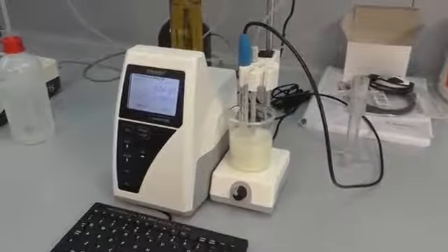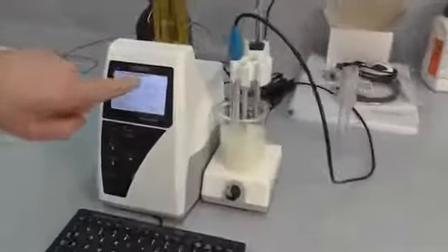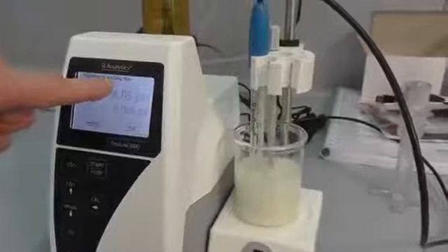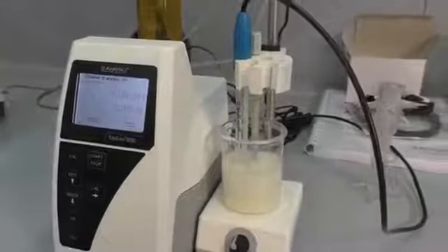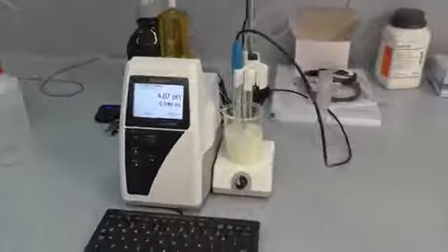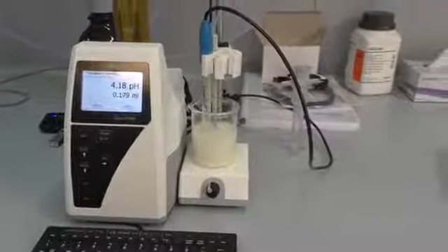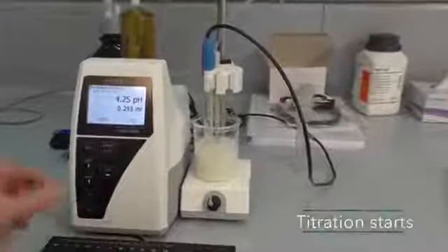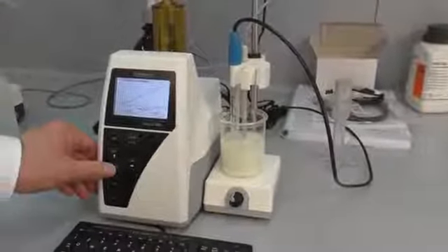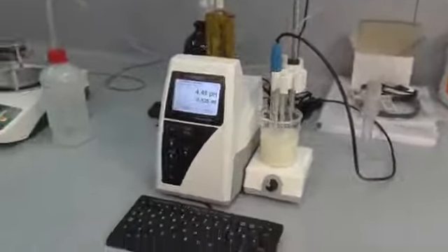So the titration starts automatically. And you can see the titration is waiting because the stirring time was 60 seconds and it's now already at 40 seconds. After the mixing time is finished, the titrator starts the titration automatically. With the mode or F5 key you can toggle between the graphic display or the titration values in pH and milliliter.